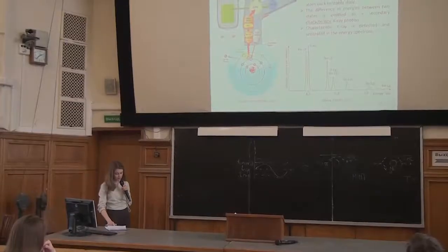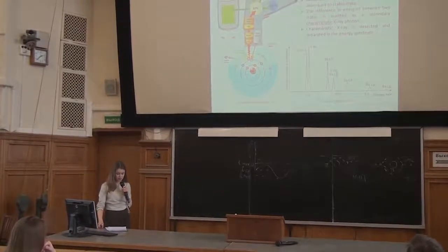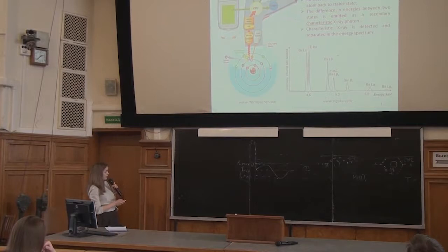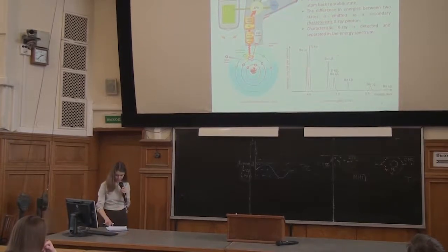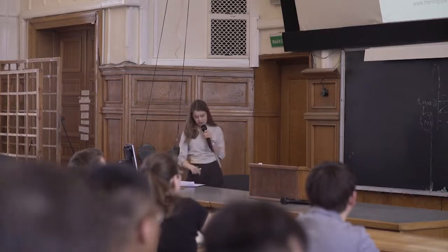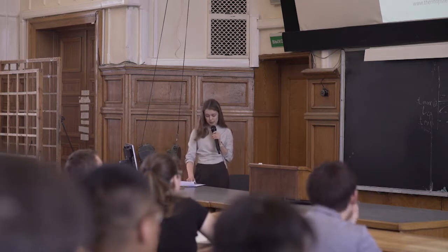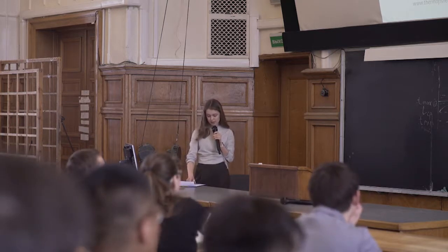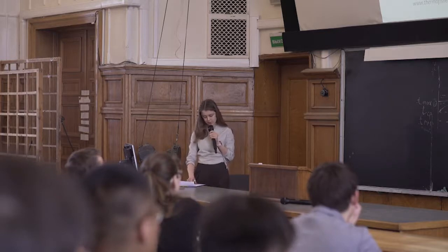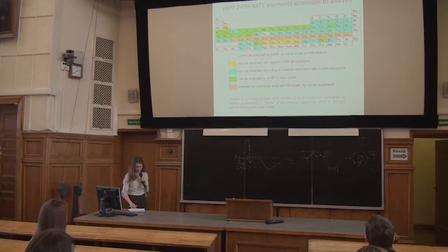For heavy elements, several electron transitions with various energy losses are possible, so in the spectrum we can see a series of energetic peaks. Here spectral lines are given in the Siegbahn notation system, and the names consist of the symbol of the chemical element, the symbol of the shell that held a vacancy, and a Greek letter denoting the particular line in the series.